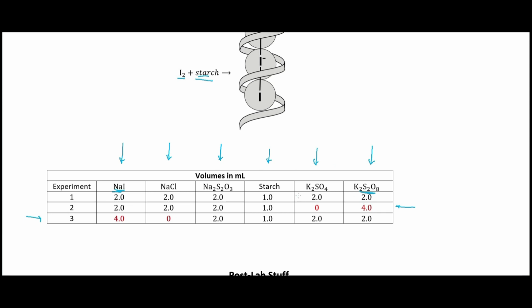In the lab, you mix these things together from left to right down this table. When we get to this last one, because this is the business end of this reaction, and this is important, you want to mix this together and then quickly shake it up and then put the rubber stopper onto it, because you want it shaken up so that you have a homogeneous solution.